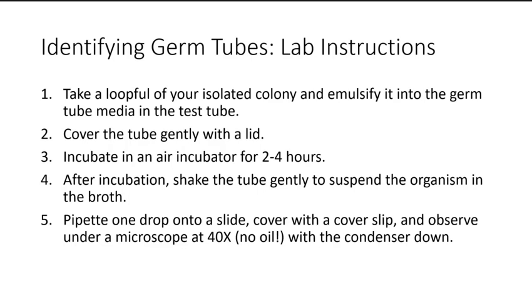Okay, and then you incubate it in an air incubator for 2 to 4 hours. After it's done incubating, you shake the tube very gently just to suspend the organism in the broth because it has a tendency to sink to the bottom since it has weight. And then you pipette 1 drop onto a slide and you cover it with a cover slip and you observe it under a microscope at 40x, no oil, remember 40x, with the condenser down.